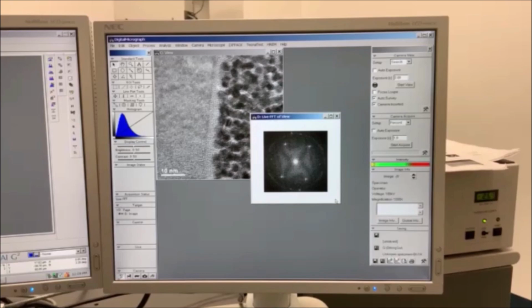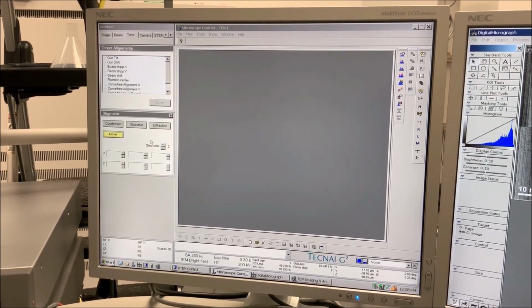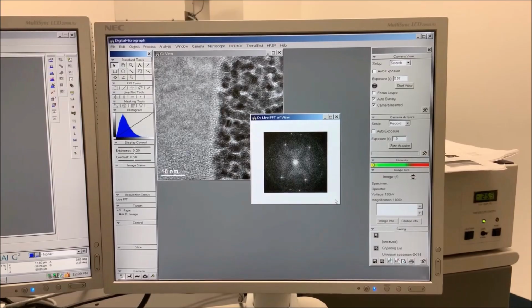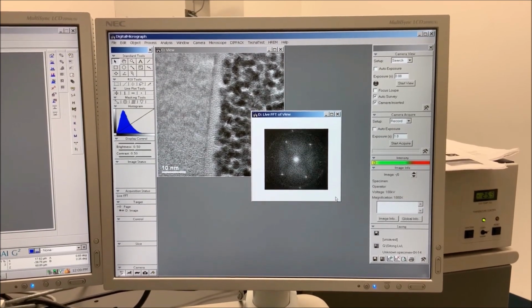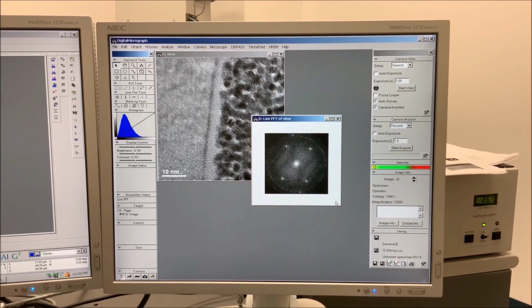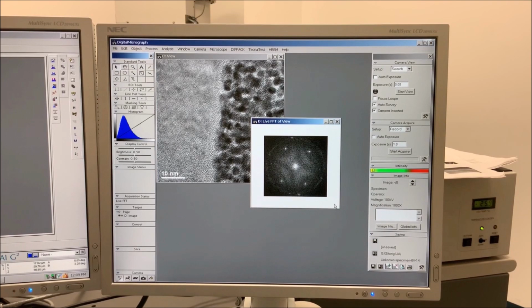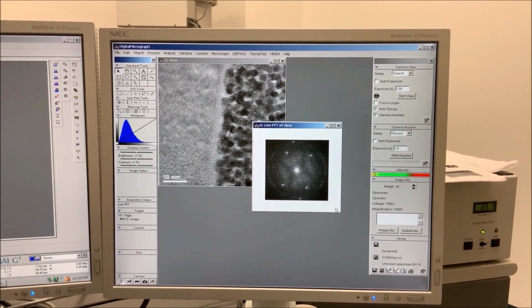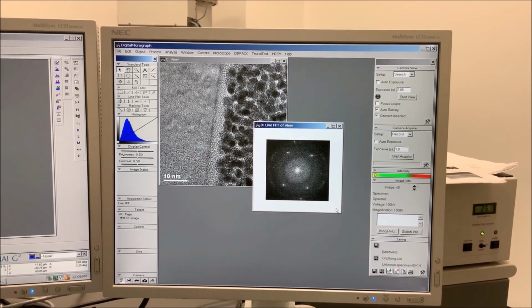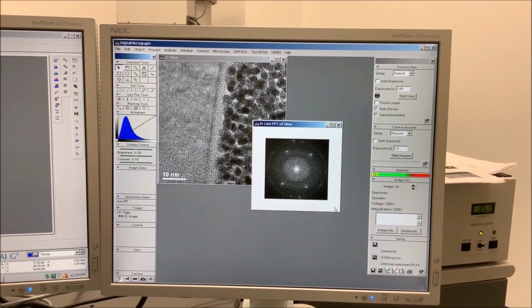To correct objective lens astigmatism, return to Microscope Control, navigate to the Tune tab, then to the Stigmator Control panel and select Objective. Use the multifunction knobs on the left-hand and right-hand panels to adjust the diffuse features in the live FFT until they are circular. Also note that for this to be effective, the magnification must be sufficiently high, generally such that lattice level detail can be observed in the image.